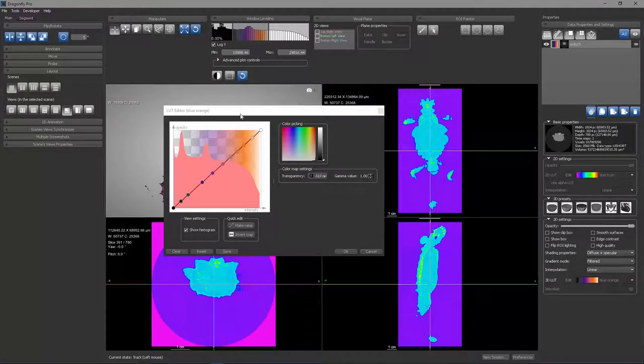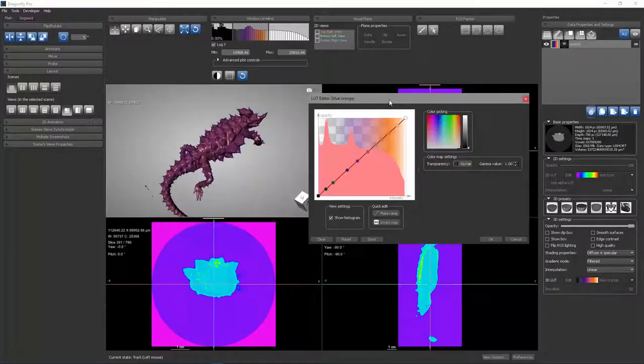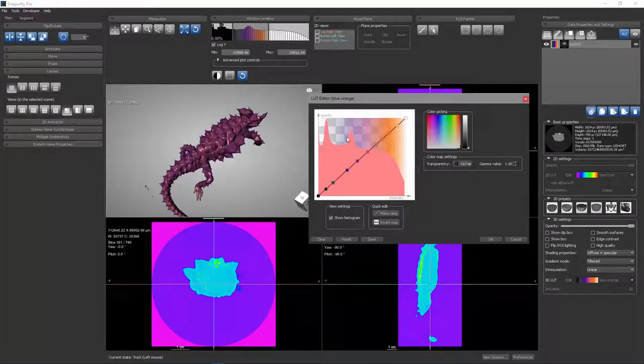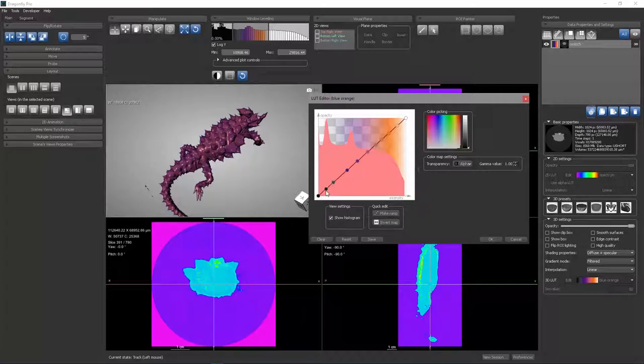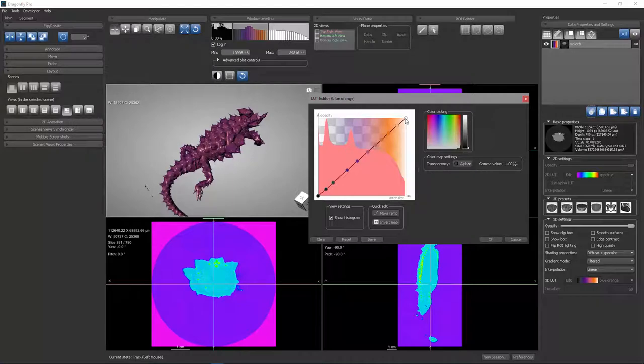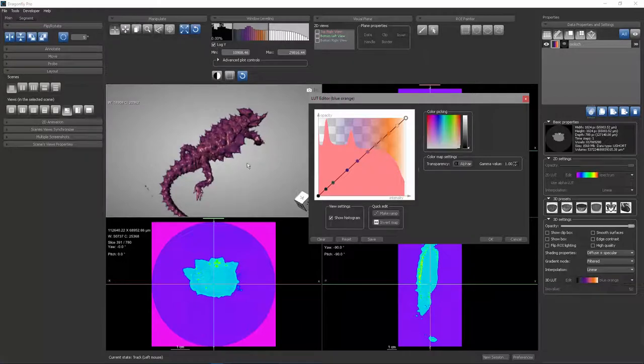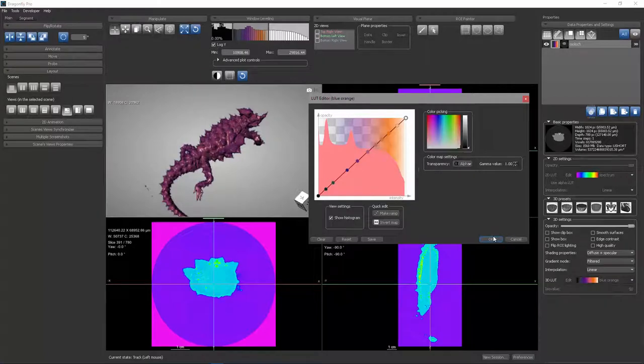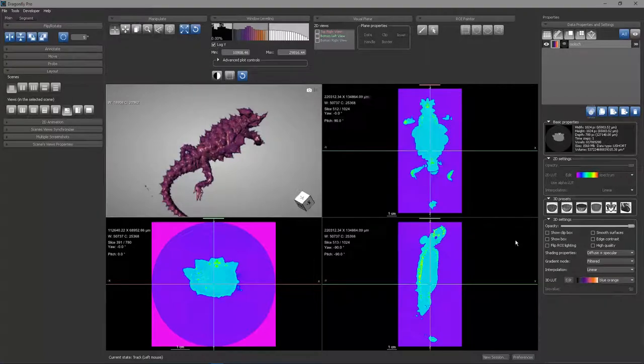This lookup table is mapping the intensities, which you see in this histogram, to the colors. And there are a number of color nodes going from black to dark purple and dark green all the way through orange and white. But each one of these nodes also has an alpha intensity, or how much transparency is associated with it. And so that's why these pixels outside don't show up at all. It's because they are all very low or very completely transparent. We'll look more at that in a minute.